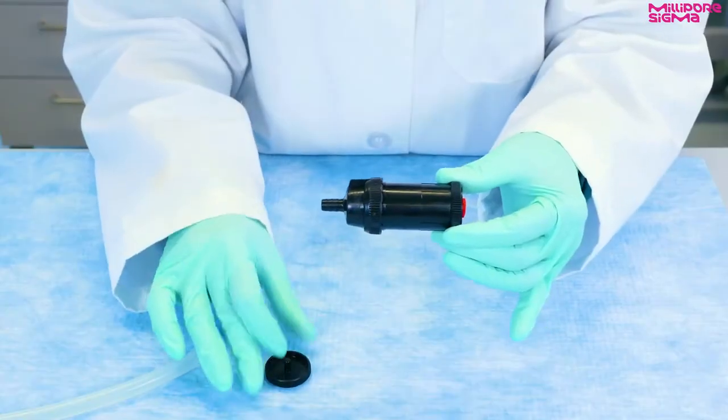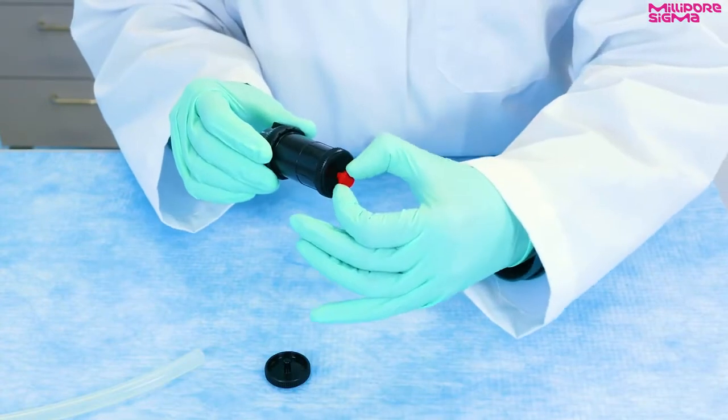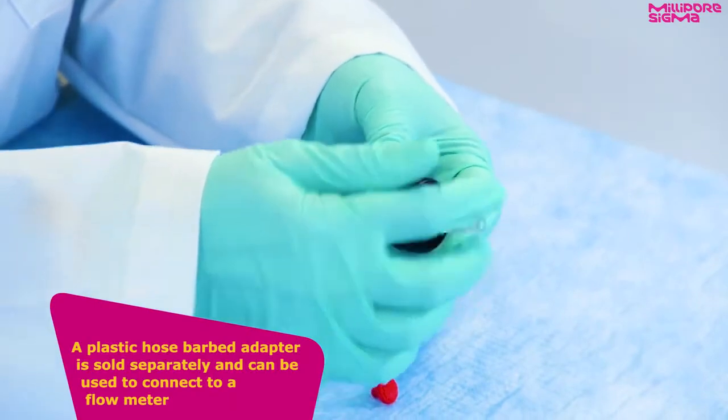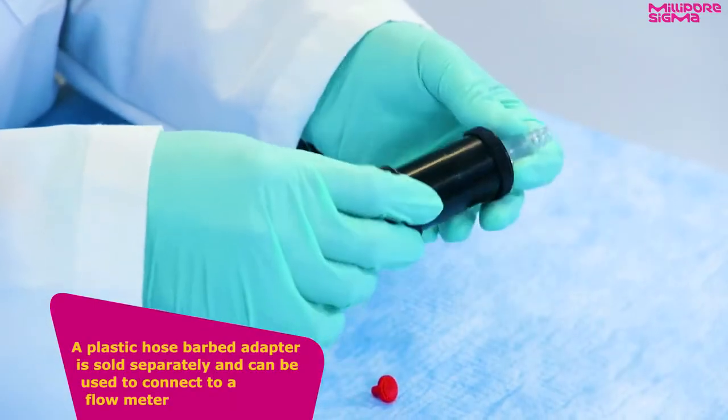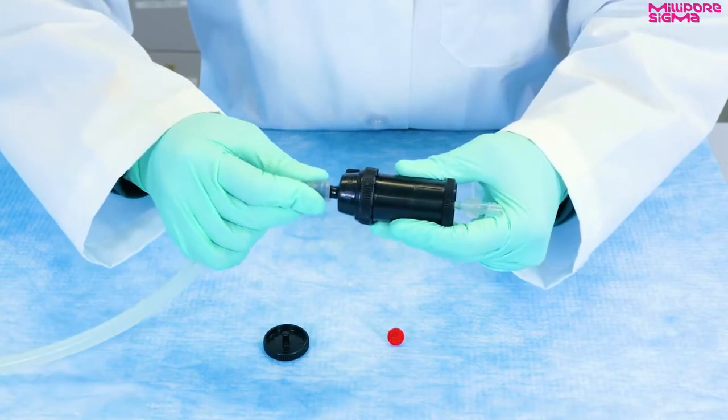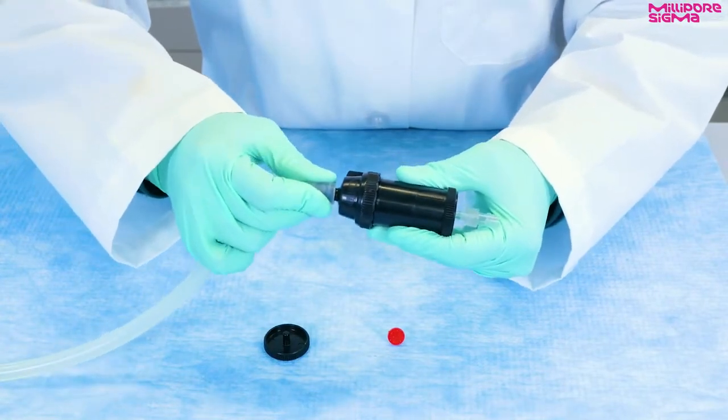To calibrate the vacuum pump with the air monitoring cassette, first remove the stand and the red plug. A plastic hose barbed adapter is sold separately and can be used to connect to a flow meter. Attach vacuum hose directly to the other end of the monitor and calibrate the pump as specified in the method.